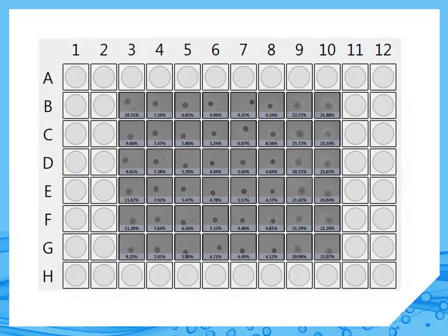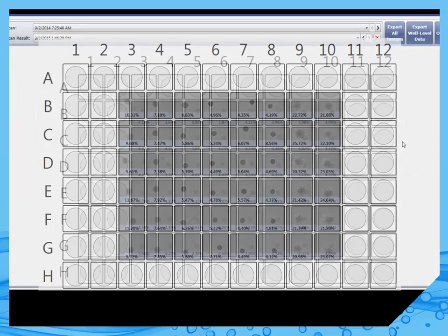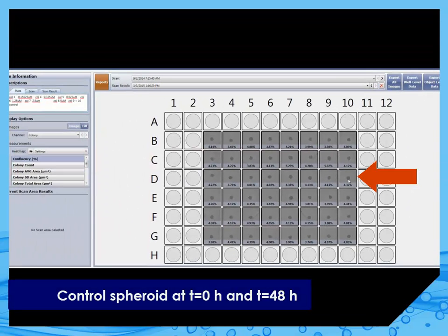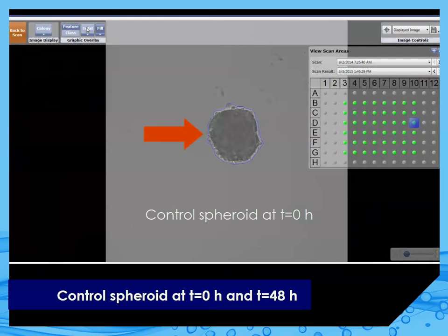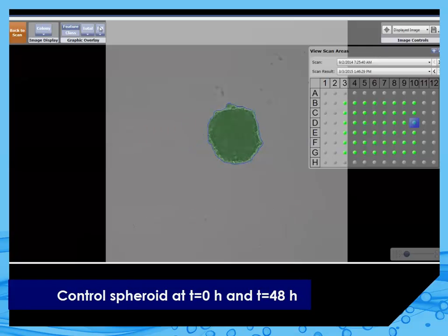Here we can see how a typical scan result after image analysis looks. The entire plate is shown with the thumbnail pictures of each imaged well. This plate represents time 0 of the drug treatment. Let's look at the vehicle control well, D10. The blue outline indicates the area occupied by the spheroid identified by the Soligo software, and the green fill color is another visual representation of the counted spheroids.